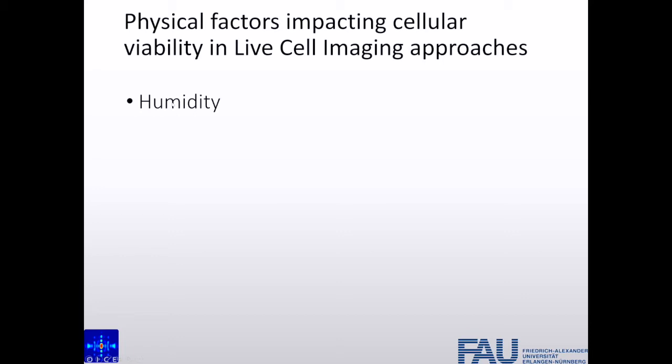There's no really monitoring system for humidity. To monitor humidity with fluorescence or imaging based methods is really hard. It's still a really important factor, especially when we image neurons and you have evaporation in your sample, you will have different results.